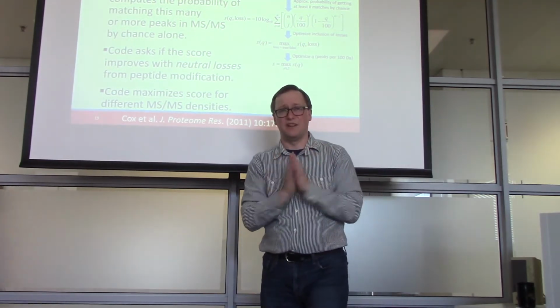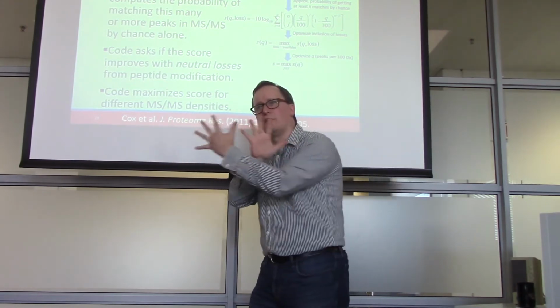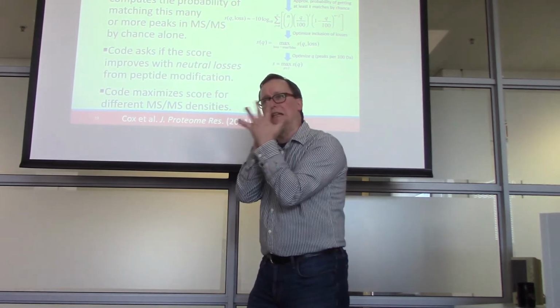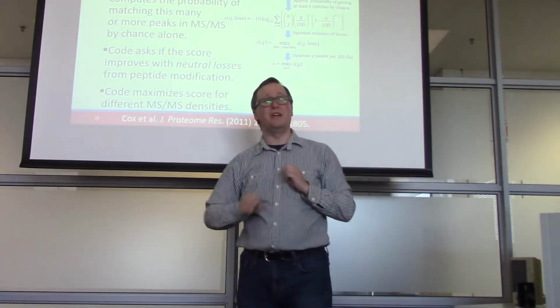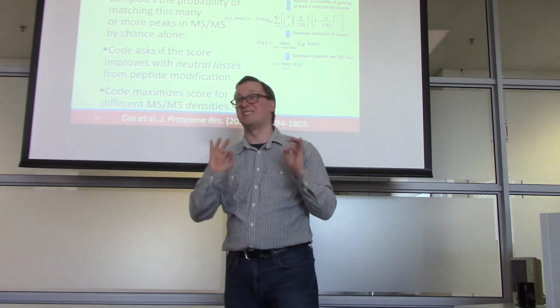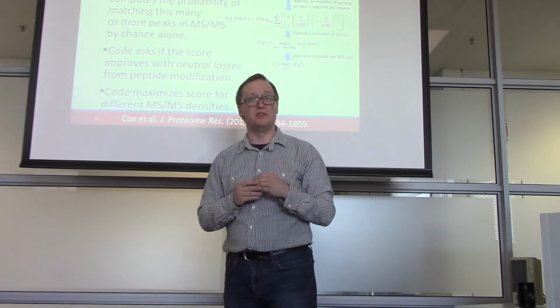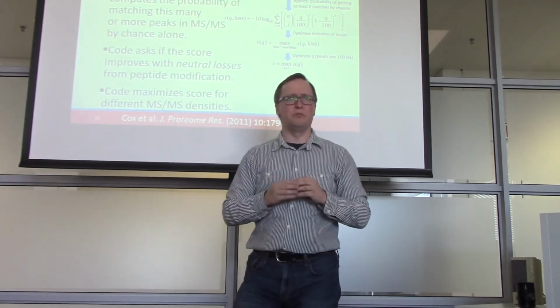Their approach is quite different. Now, before, we were talking about one spectrum sliding past the other and asking how much better they were when aligned versus when they were not. Andromeda is something that we call a match counter. There are lots of algorithms that use techniques like this, so I thought it was a good example to use for that purpose. So we're using the binomial distribution.